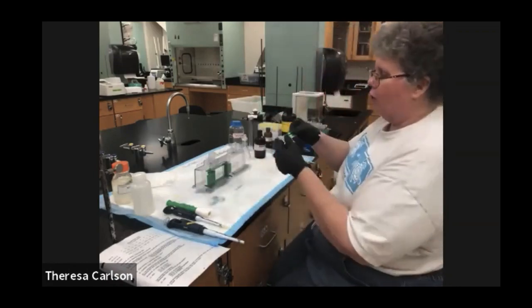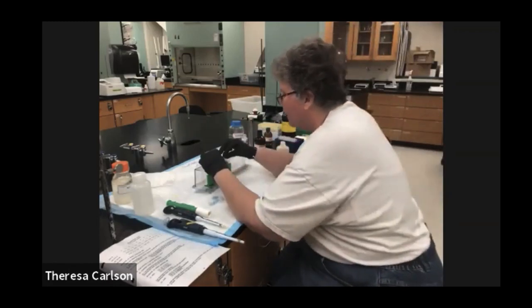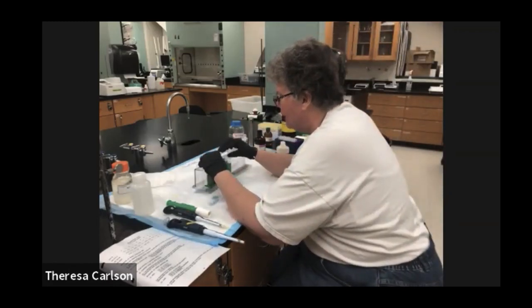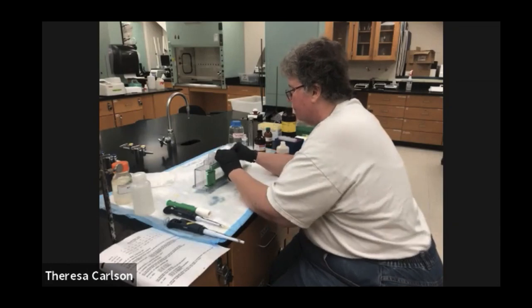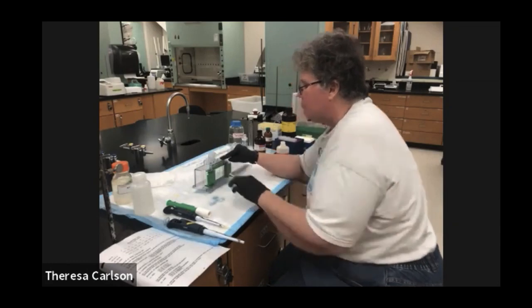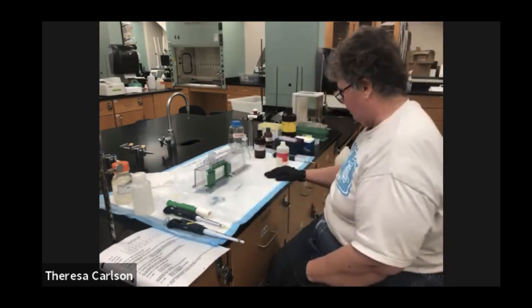Don't forget to put your comb in, the raised side of the comb towards you. A little bit may spill out, that's okay. You're just going to push it all the way in, just like that. A little bit may spill out, that's fine. That's why we have the bench cover right here.